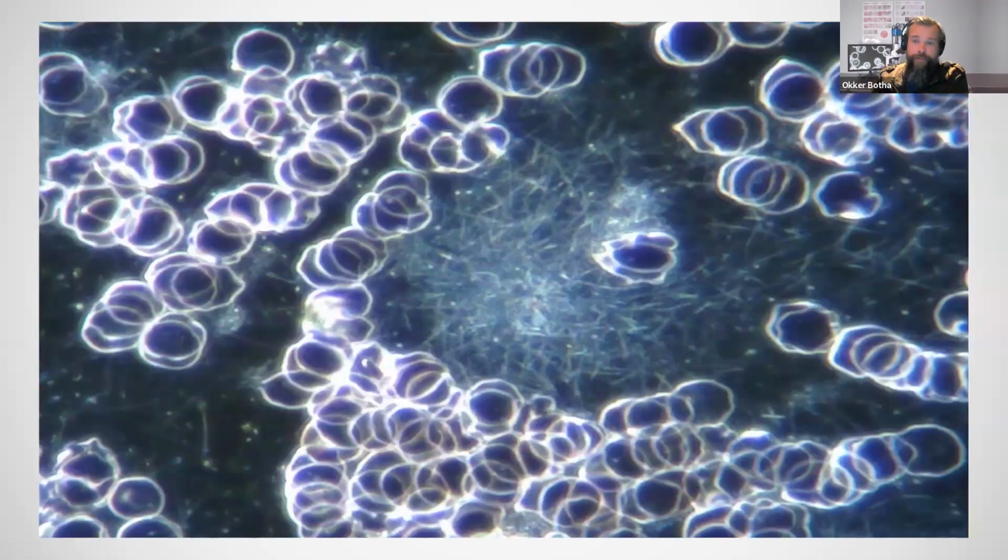All right, so this is a dark field image. This is with the HDMI LED microscope, with the 40 times objective being used. So we're looking at about 1,600 times magnification on the screen here. Some of you may not be familiar with the components here, but these circular patterns on the screen are the red blood cells.